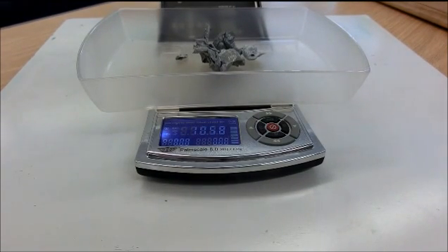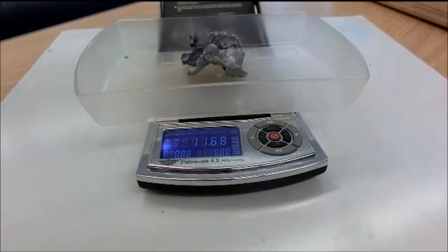This is the mass for 3B4. We have 10.58 grams of zinc for class 3B4. The mass of the zinc for 4B5 is 11.68 grams.